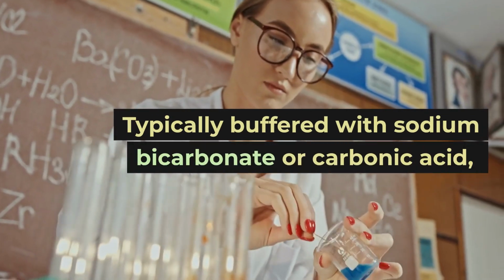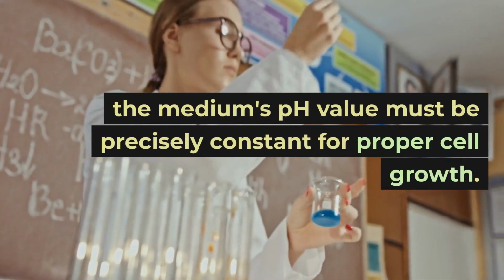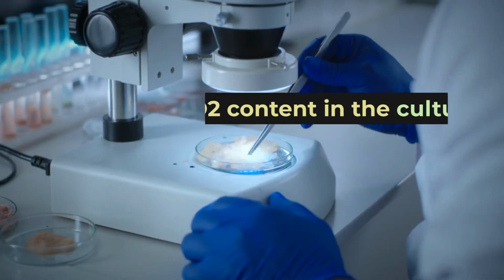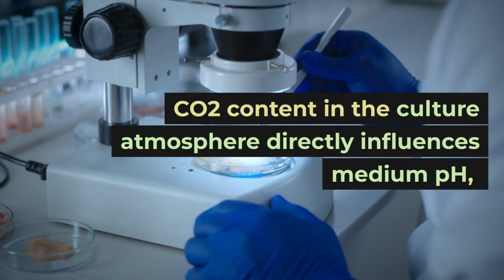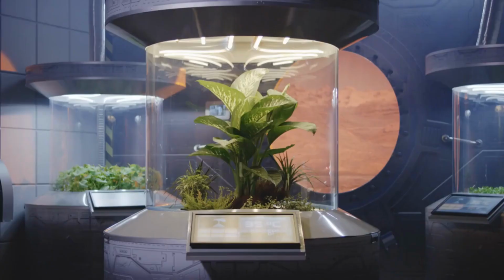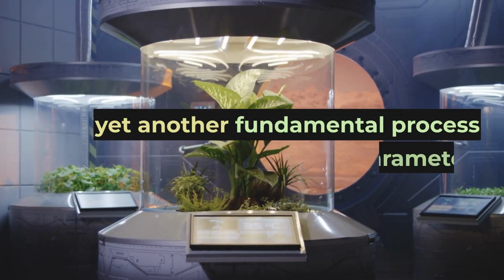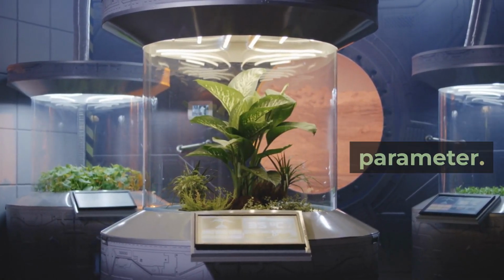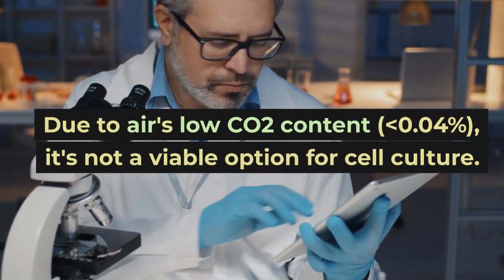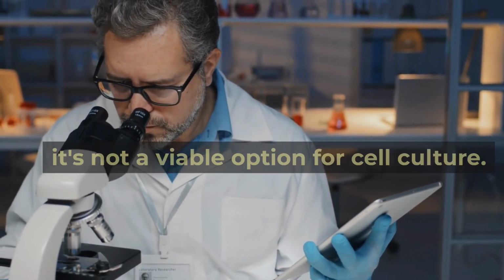Typically buffered with sodium bicarbonate or carbonic acid, the medium's pH value must be precisely constant for proper cell growth. CO2 content in the culture atmosphere directly influences medium pH, making control over the gas mixture in which cells grow yet another fundamental process parameter. Due to air's low CO2 content, less than 0.04%, it's not a viable option for cell culture.